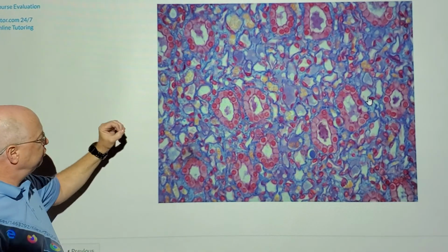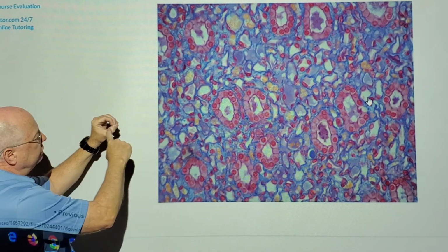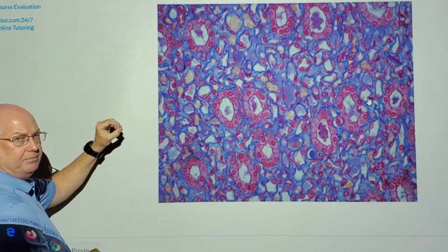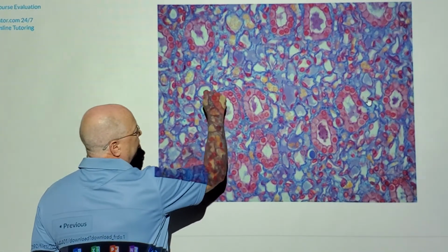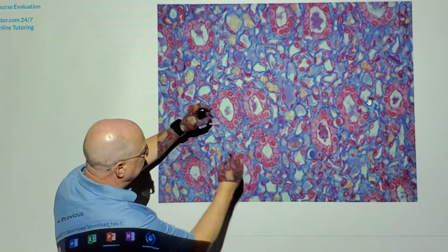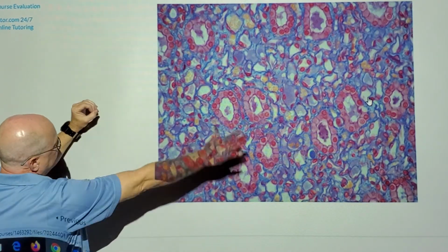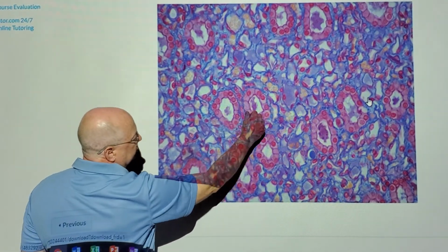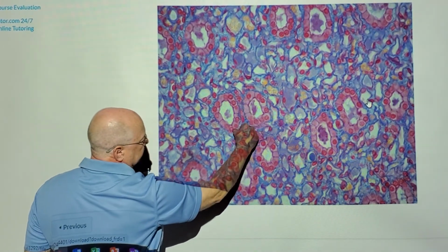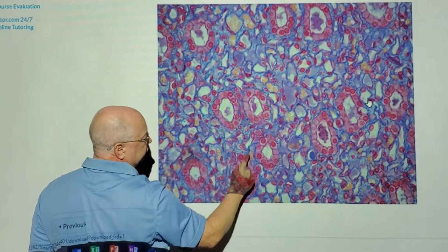And so when a tube runs from the surface of the body, this is the outside world. The walls of the tube are the epithelium. So this is the outside world, this empty space where you see light flowing, and we're seeing multiple tubes next to each other, okay? As we slice through those tubes, this is the outside world. This little blue line is the basement membrane, or the basal lamina, that surrounds each little ring of cells.